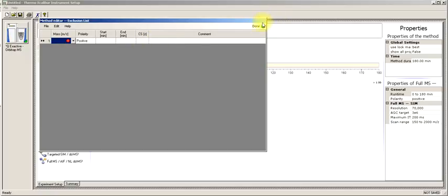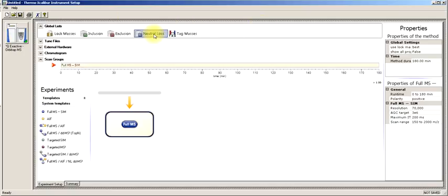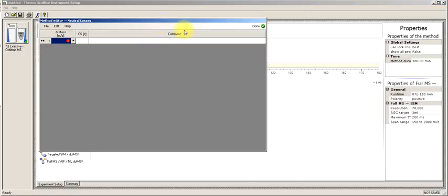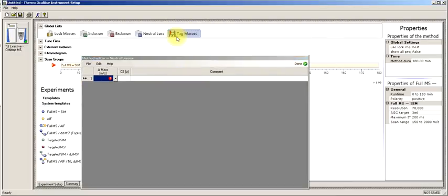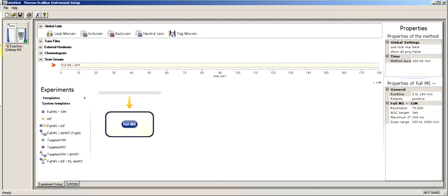You can also list them by charge state. You can also set neutral loss masses in case you are using the neutral loss method that the Q Exactive comes equipped with. You can also use tags if you know that you have a known mass shift because you tag some of your peptides, say with SILAC or whatever. You can specifically go after those.